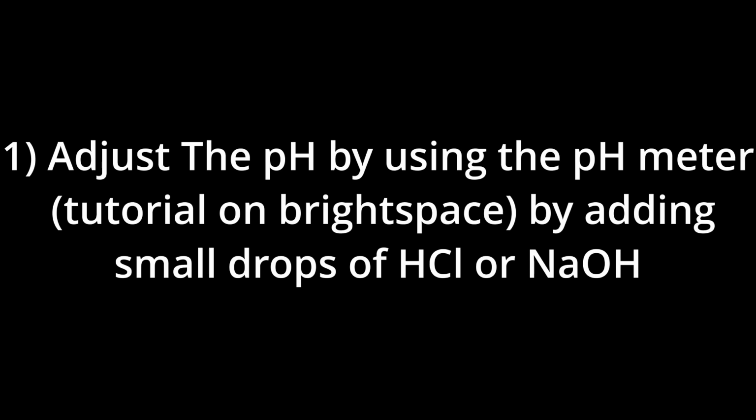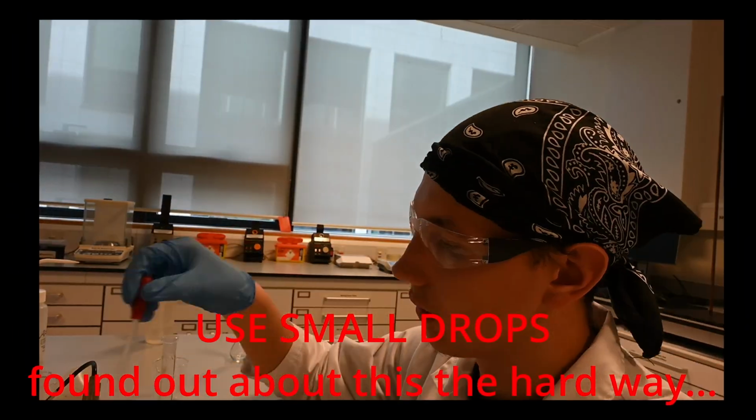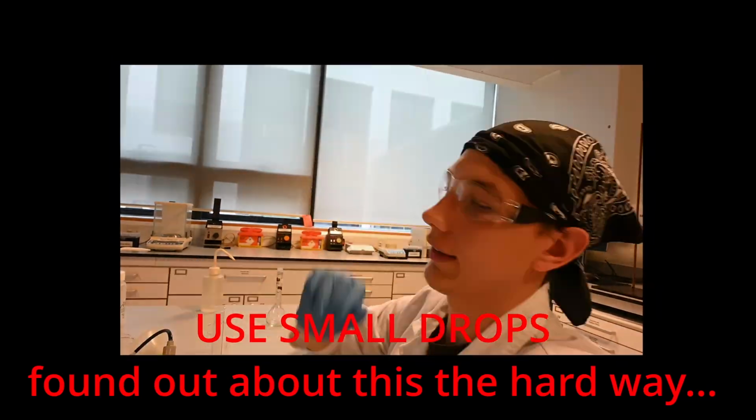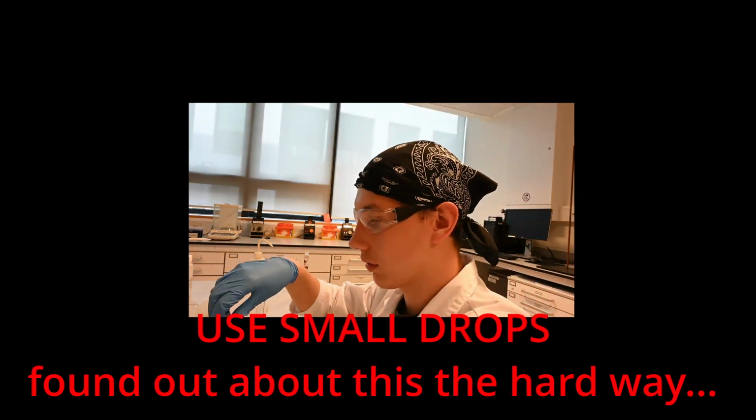Okay, I'm going to stop the yapping here for a little bit. This pre-lab video is already getting slightly too long, so I'm going to give you exact bullet points of what you have to do after you measure out your sodium phosphate and sodium bicarbonate. The first thing you want to do is adjust the pH to around 7.42 using small drops of hydrochloric acid and NaOH. Quick note, make sure to use small drops. What I found doing this experiment is even adding 2 drops instead of 1 can make a massive difference in pH on the pH meter.